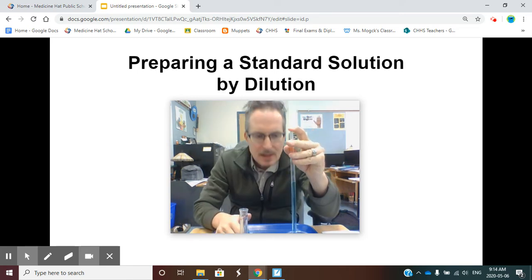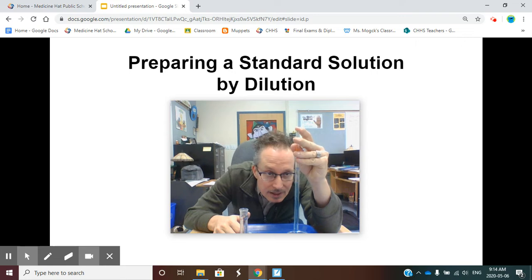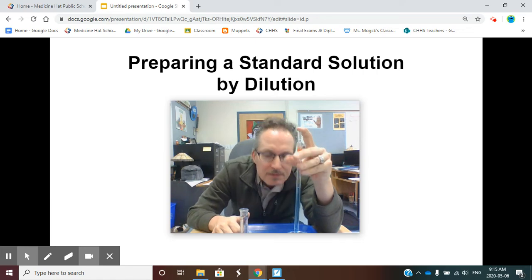Finger on top. I'm going to get down to eye level, and we're going to gently roll your finger so the bottom of the meniscus is on the 0. Perfect.